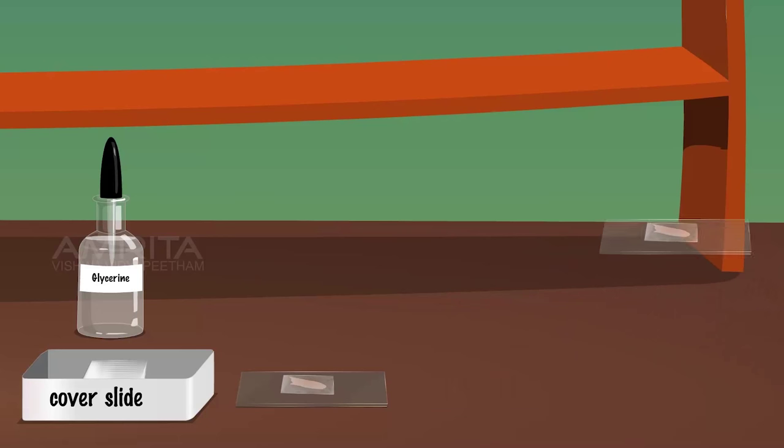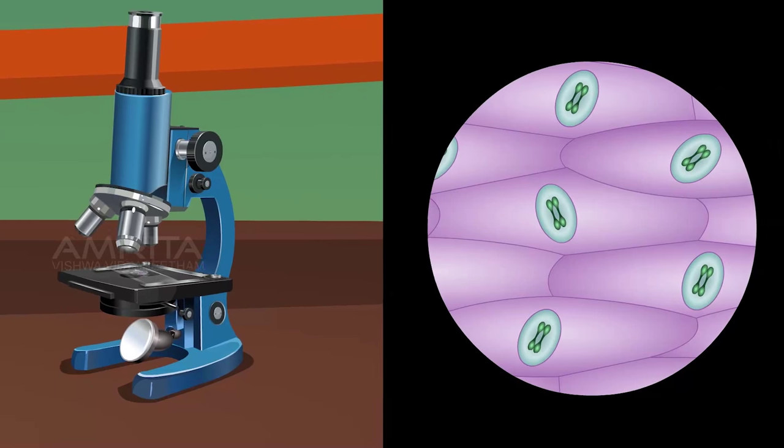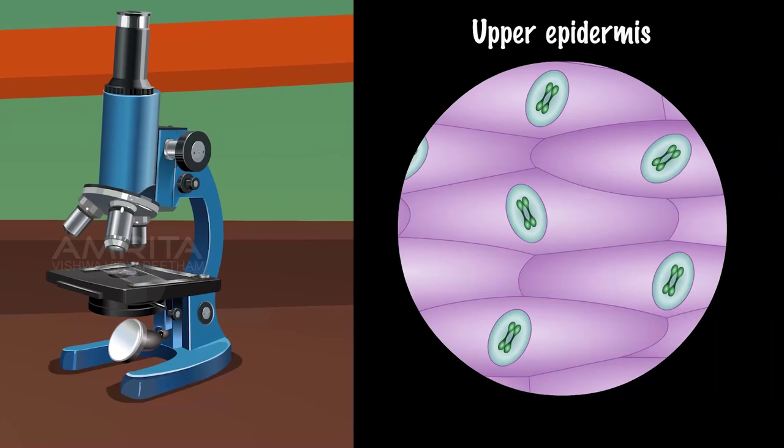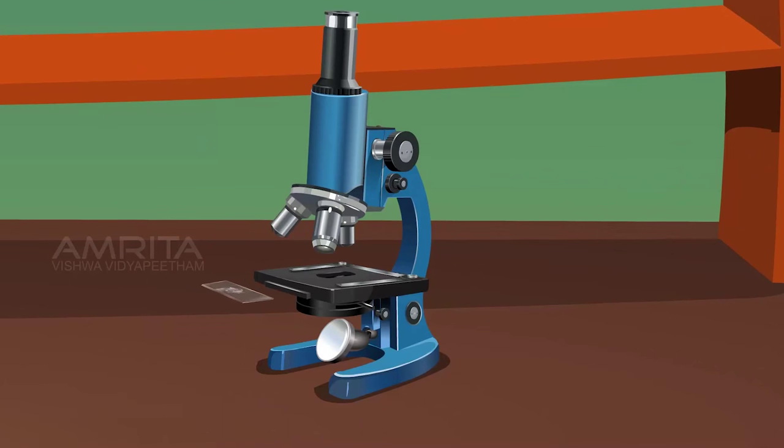Place both glass slides one by one on the stage of the compound microscope. Observe them under the microscope. Count the number of stomata in the peels of both the upper and lower epidermis of the leaf appearing in the microscopic field.